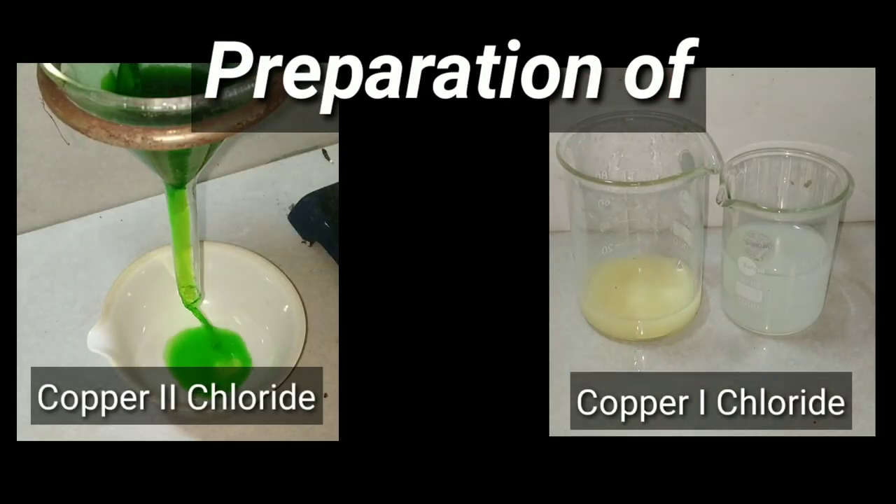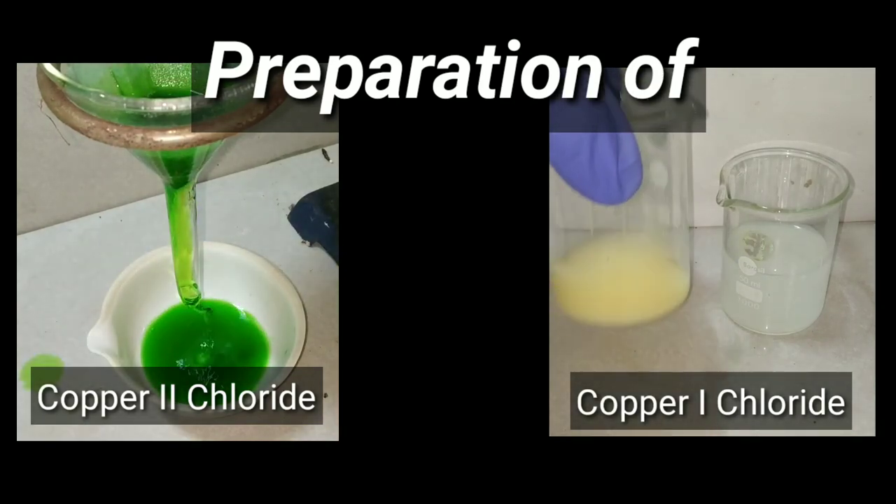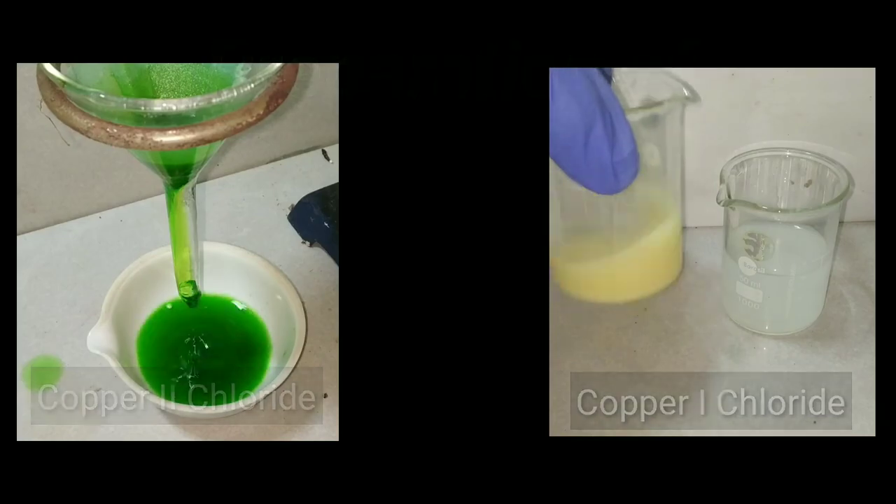Friends, in this video we will be preparing copper 1 and copper 2 chloride. First of all, let us make copper 2 chloride.